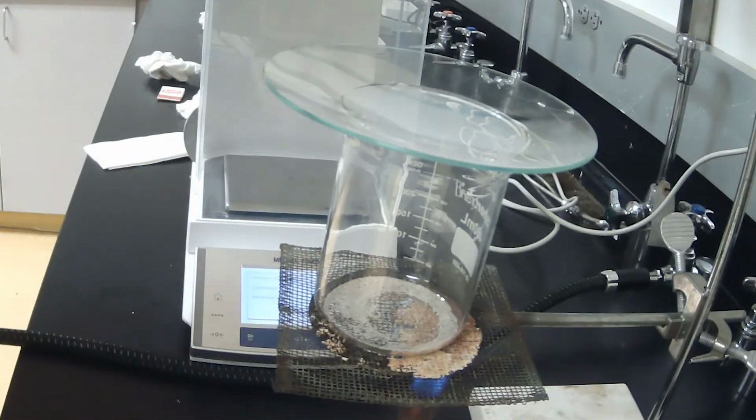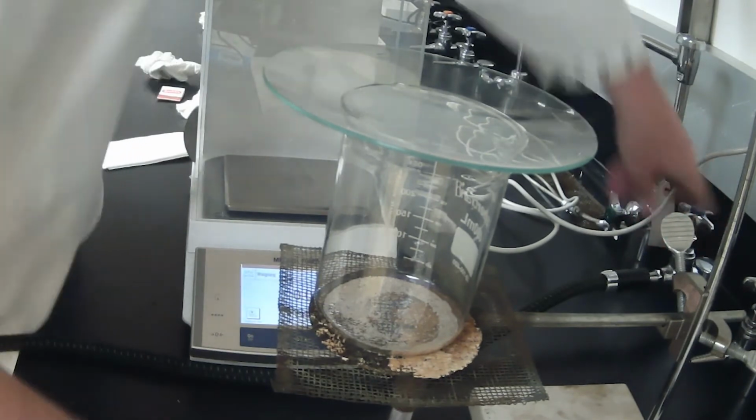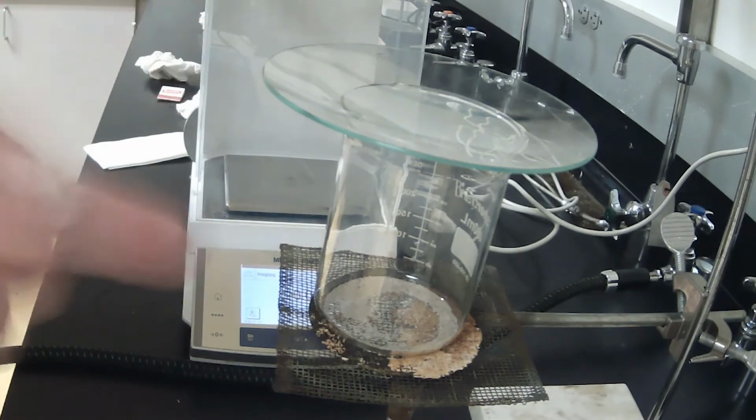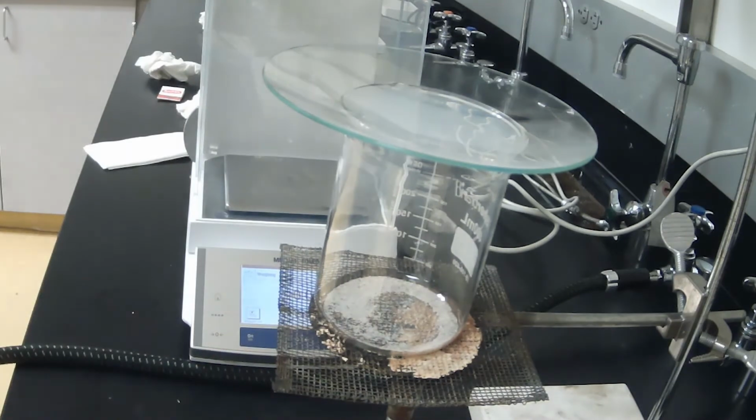Okay, we have our 1-inch gap. We're now going to turn off the Bunsen burner. And again, we're going to let it cool for about 5 minutes. But before we turn it off, you should notice that there is a faint haziness on the top part of the glass. That is the final remnants of our ammonium chloride. So after this cools, we'll wipe it one more time and we'll go to the next phase of our experiment.